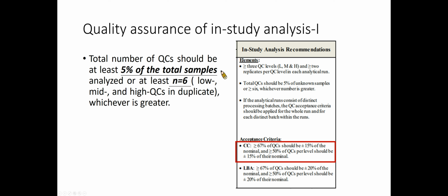Calibration curves and QCs should be included in all analytical runs. The QCs should cover the expected study sample concentration range. Typically, the same curve fitting, weighting, and goodness of fit determined during the validation should be used for the calibration curve within the study. A change in the response function relationship between the validation and study sample analysis indicates potential problems.